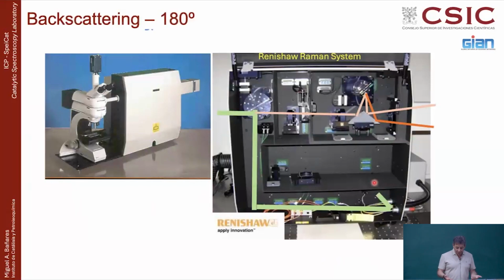Nowadays, the Raman system looks like this. Light comes from behind, where the lasers are behind there. Here you have a beam expander to make a thicker, homogeneous laser beam. Here you have a mirror, takes the laser into the microscope, and then it goes back. Somehow you get rid of the laser, and only the non-laser light, which is Raman, goes in through the slit. This is a mirror, a grating to disperse the light, and the detector.